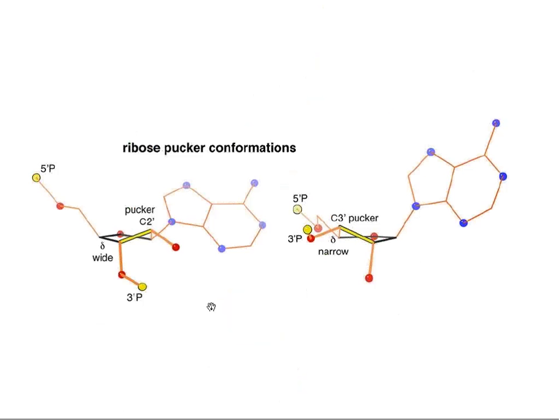So one of the most influential and awkward things about RNA backbone is getting the ribose pucker right. And in RNA, this is not true in DNA. It really is two-state to a very, very good approximation. If you're going to do catalysis, you end up with other puckers, but in an equilibrium structure that you would do crystallography on, even at small molecule level, essentially the pucker is either C2' endo or C3' endo.